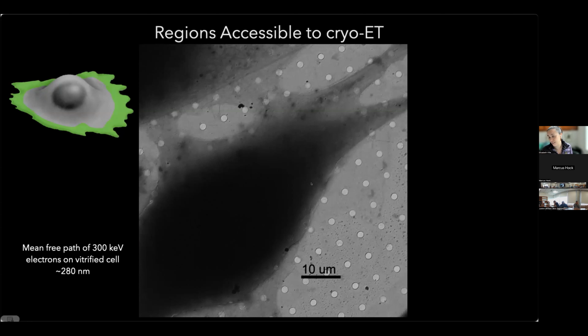Mean-free path means the distance an electron will go and have at most one interaction with a sample. If it interacts multiple times with the sample, then it doesn't really have information that you can use. So basically, things that were more than half a micron were pitch black.